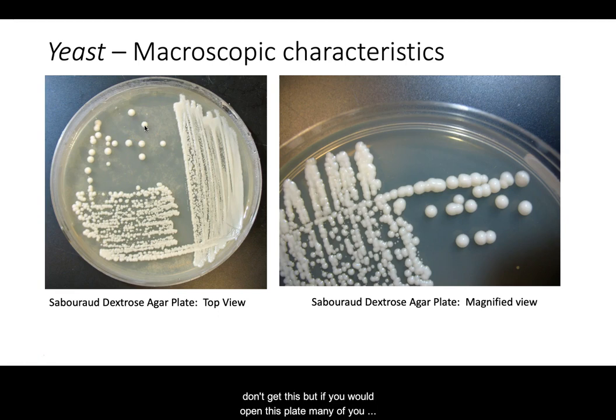You don't get this, but if you were to open this plate, many of you commented about how poorly bacteria smell and that it's never fun to smell E. coli or any of the bacteria. If you were to open this plate, it would smell like you were kneading dough. So much of that smell you get from baking bread is attributed to the yeast. And so this would be like raw dough, which has quite a nice smell to it.